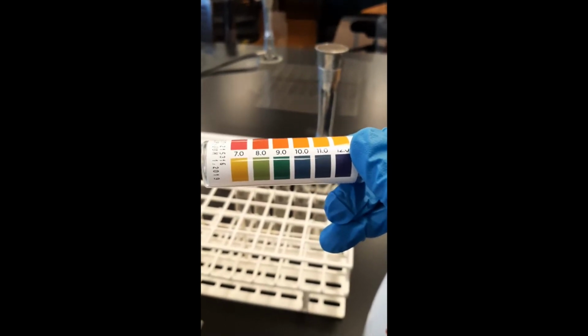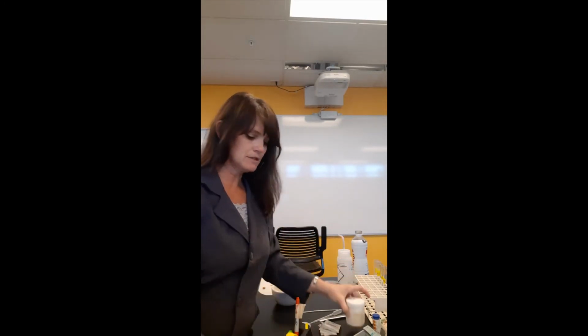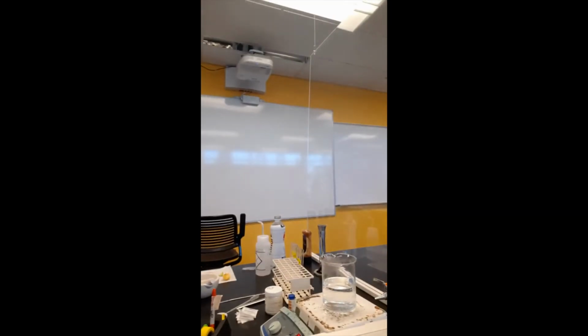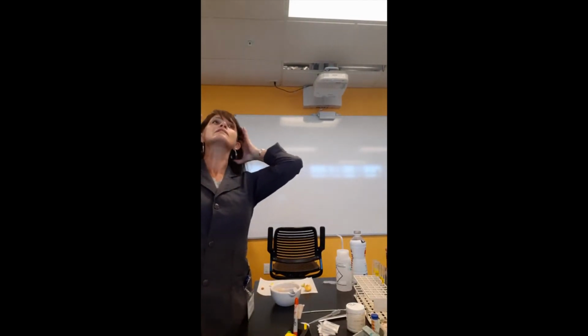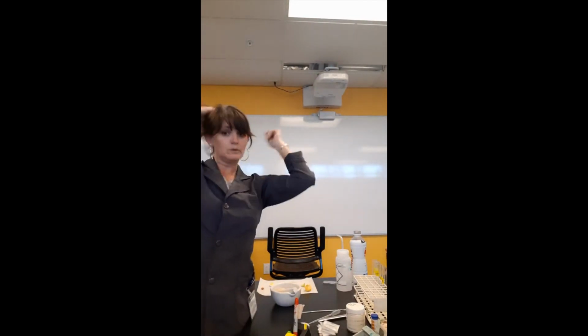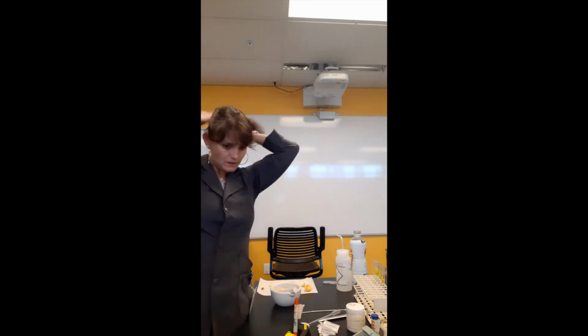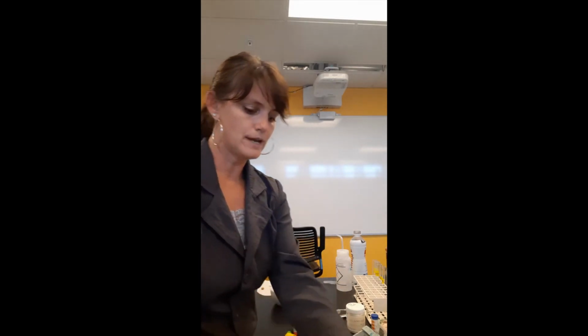Since I am in the lab, I will be practicing safety protocols, especially since I'm using caustic chemicals and a heat source with boiling water. So that includes putting my hair back with the tie. We would ask you to do this in the lab if you were here with us. I'm going to go ahead and wear gloves again because of the caustic nature of my reactant.